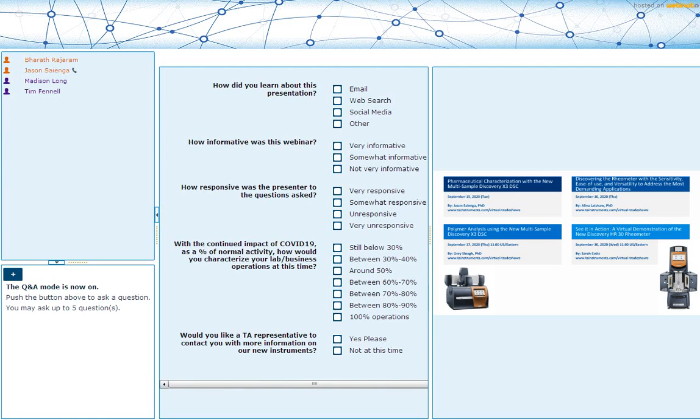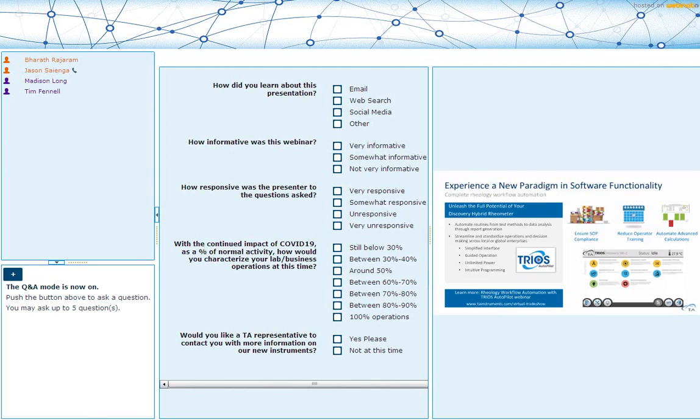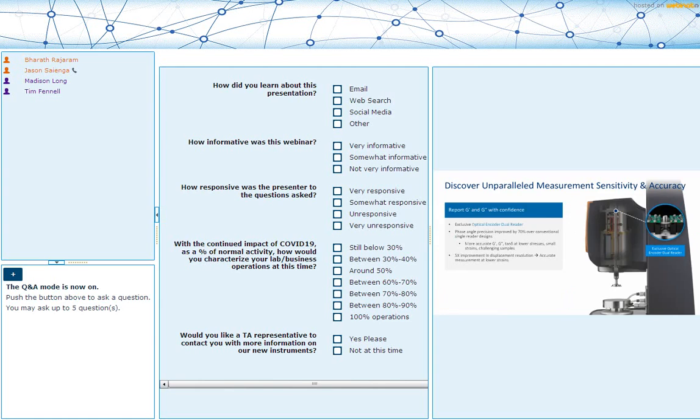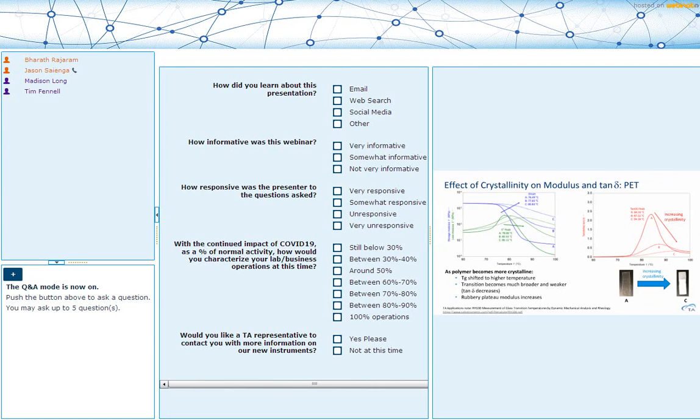So if we go back to our example, I'll go back a few slides. The amorphous material has a much higher tan delta peak compared to the crystalline and semi-crystalline materials. And that tells us that the amorphous material is going to be a lot more flexible as it goes through the transition and after that transition, compared to any material that has elements of crystallinity to it.